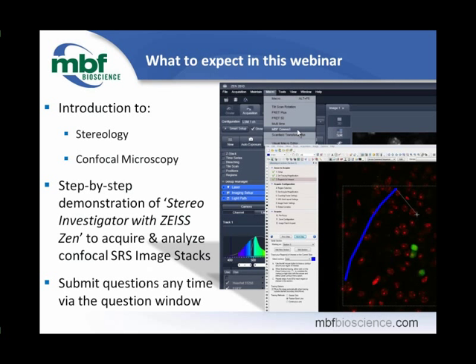In this webinar, you can expect to see a short introduction to stereology, confocal microscopy, and an explanation as to why the two are a natural fit. A step-by-step demonstration of Stereo Investigator along with ZEISS Zen for the acquisition and analysis of confocal systematic random sample image stacks.